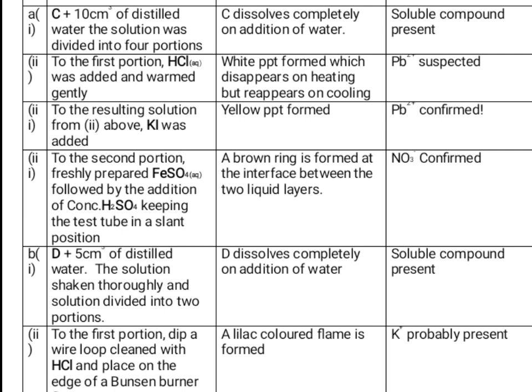Once you see that, it is the confirmatory test for trioxonitrate 5 ion. So your inference will be NO3- confirmed.